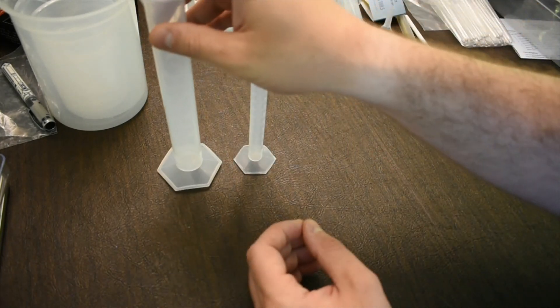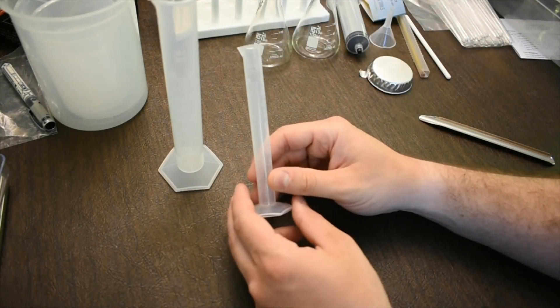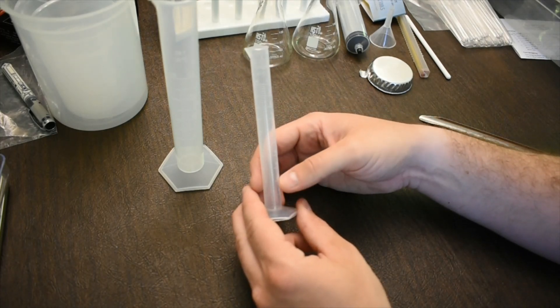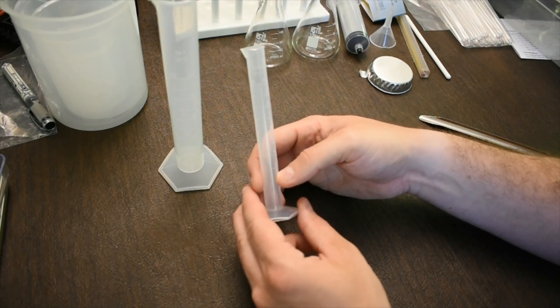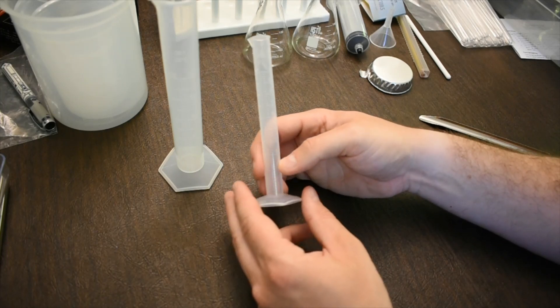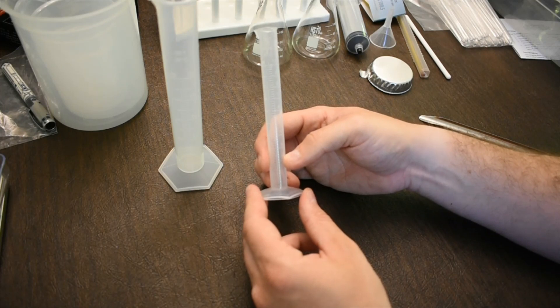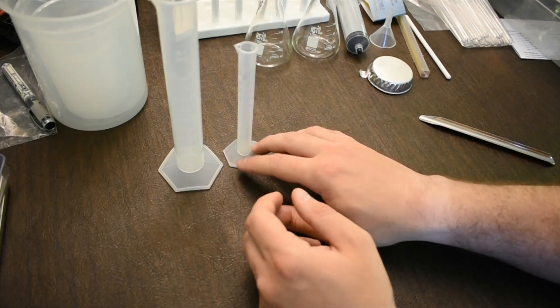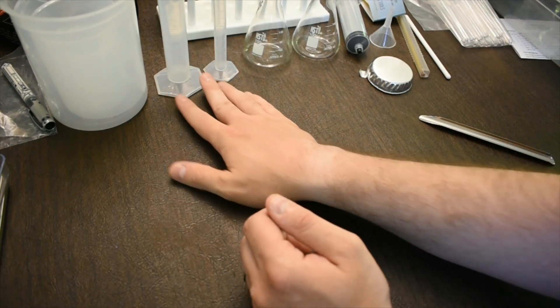The smaller graduated cylinder has a maximum volume of 10 mils with 0.1 ml increments, so you can measure down to, say, 2.1 and estimate between 2.1 and 2.2, giving you two decimal places. The only limitation is its smaller total volume.